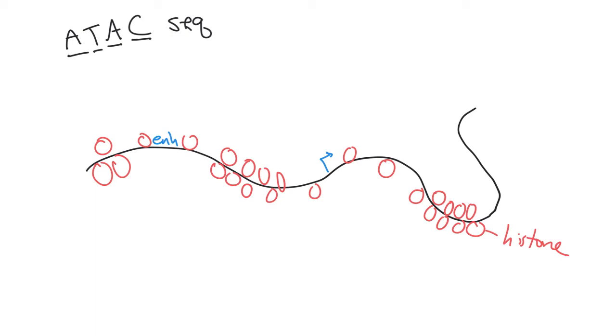The idea here is that there's a short piece of DNA, Tn5, which is a transposase, a type of jumping gene. And in this case, that green is DNA. It's been chemically modified to include particular DNA sequences in yellow that are going to be primer sites for polymerase chain reaction amplification. And what happens during ATAC-seq is, as usual, cells are collected at a particular point in development, a particular point in time when the scientist is curious about where the enhancers and genes are.